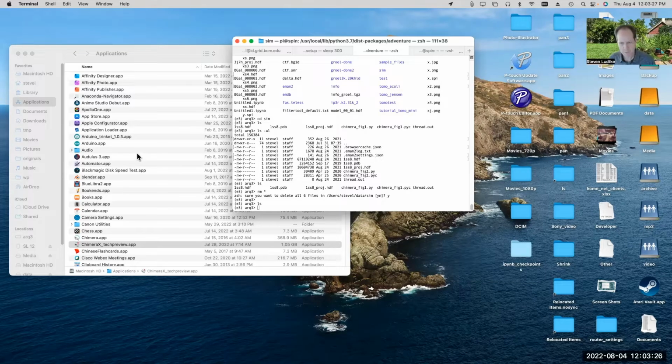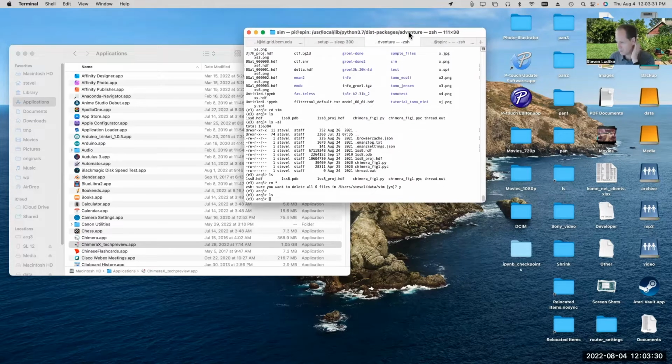So I think the plan today was to take a PDB file and see if we can generate something like simulated cryo-EM data that we could then use with the Gaussian mixture model to do some dynamics analysis on it. It's not quite as interesting, maybe, as working with real data, but we may get back to some real data stuff later on too.